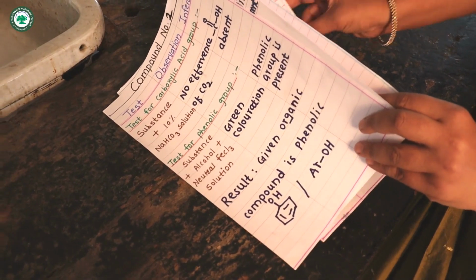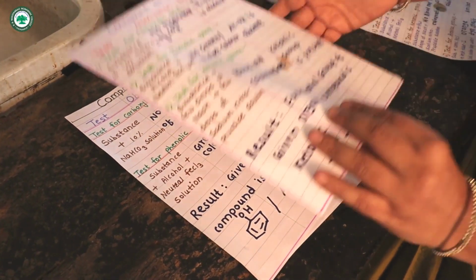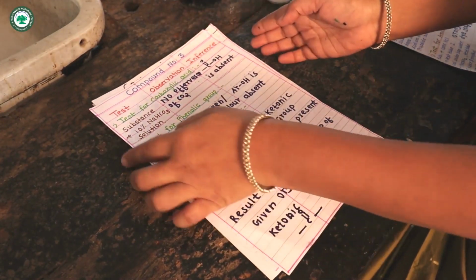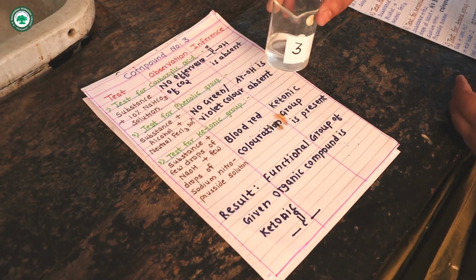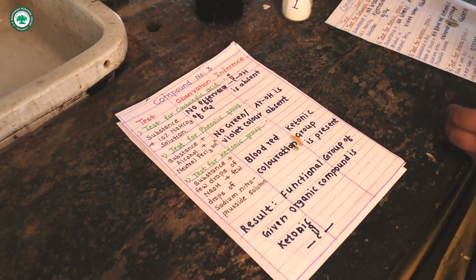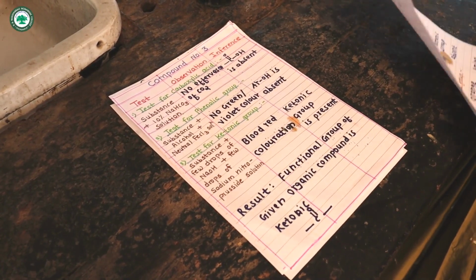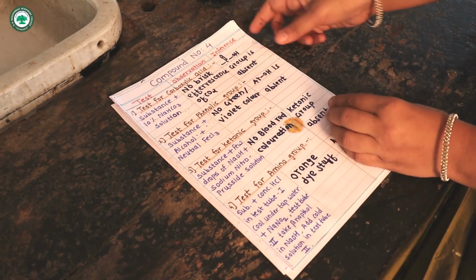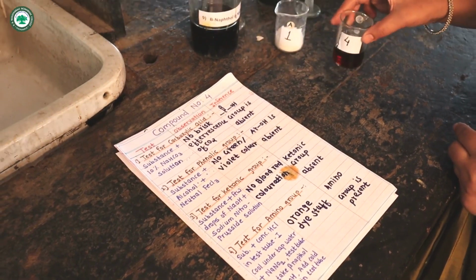Then for compound third, functional group is ketonic group. And functional group of compound 4 is amino group.